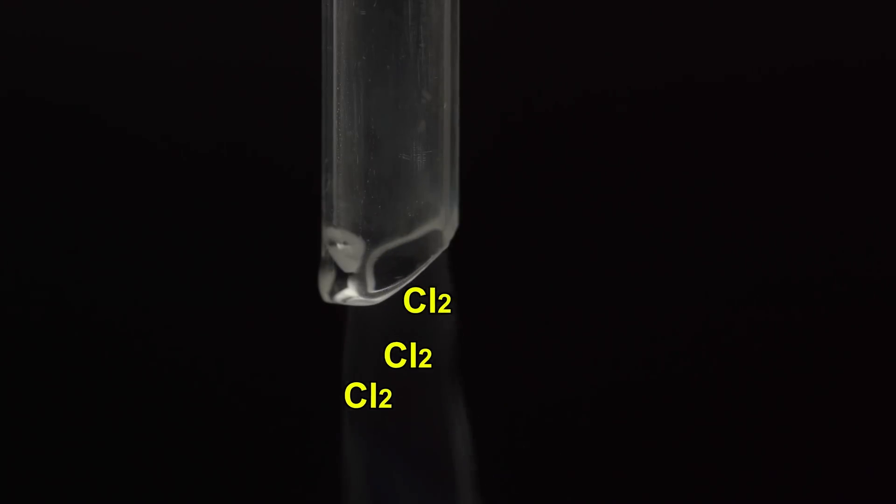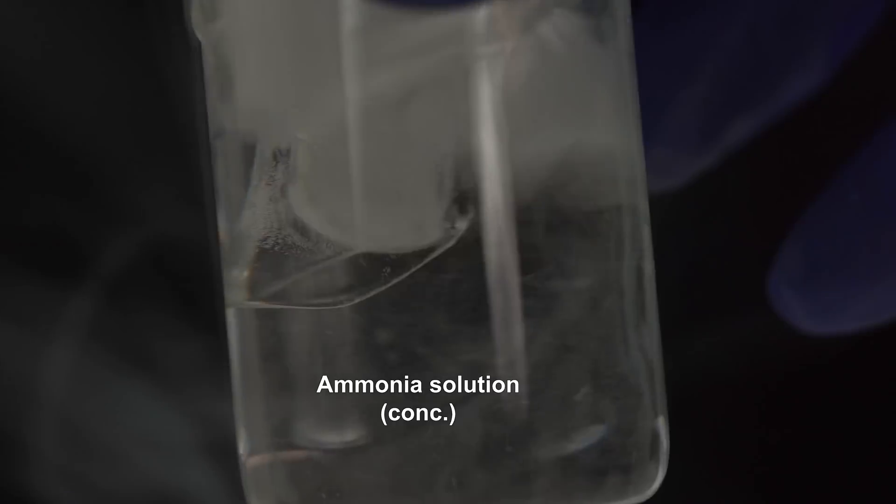Hey guys, in one of my previous videos I showed you a case of yellow-orange chemiluminescence that takes place when chlorine is passed through concentrated aqueous ammonia solution.